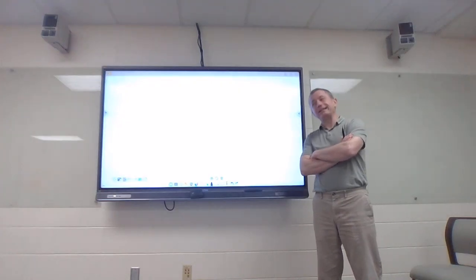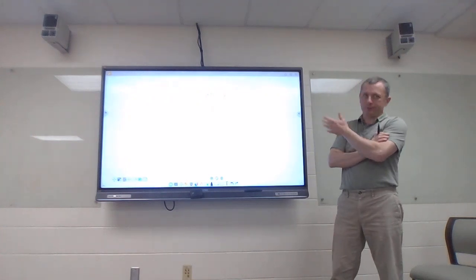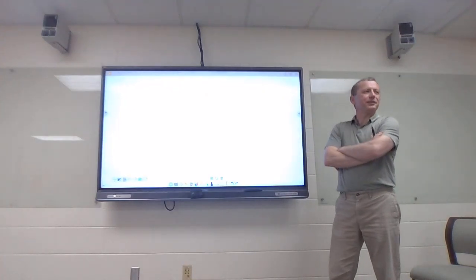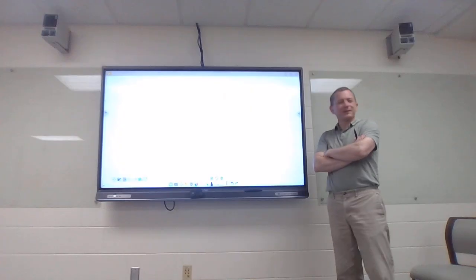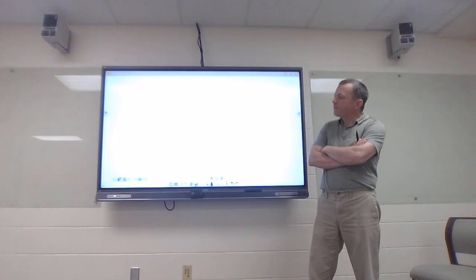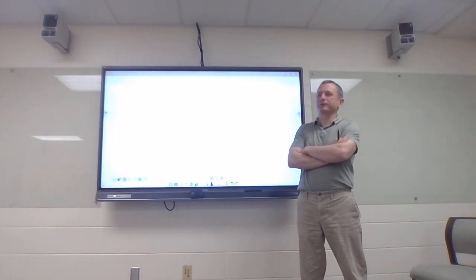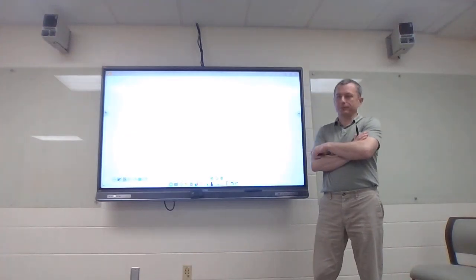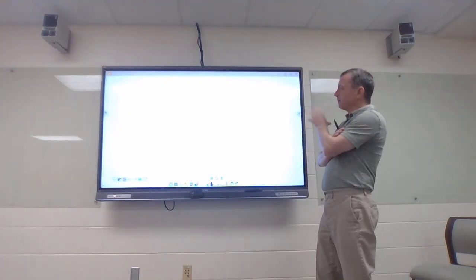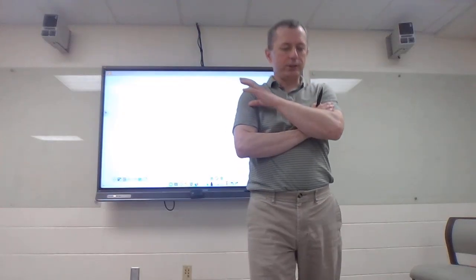Now, if I had carbon and a proton, sometimes the two together can be helpful, more often in the two-dimensional side of things than in the one-dimensional side of things. But that's graduate level. We've got a limited amount of time in 311 to try to cover this, so we're going to focus on proton. And everything we learn with a proton can be applied to other things in carbon and phosphorus and fluorine, just slightly different numbers, all right? So right now we're going to focus on just hydrogen NMR.